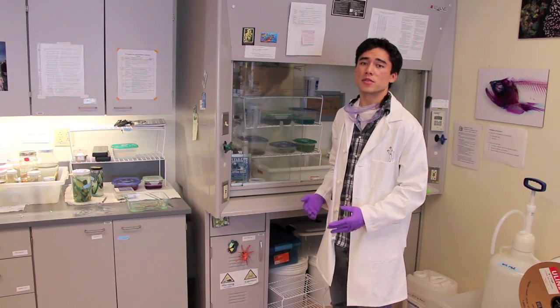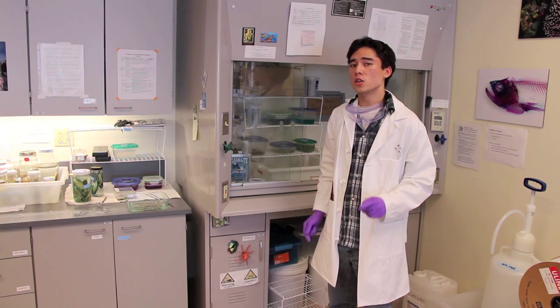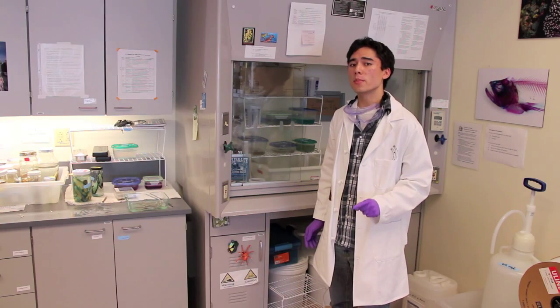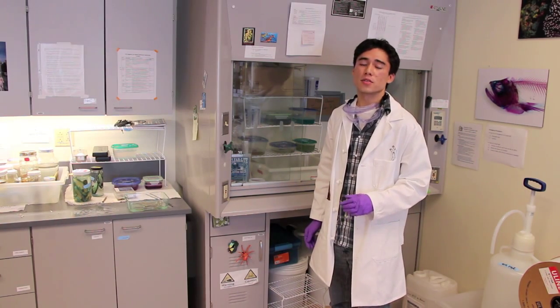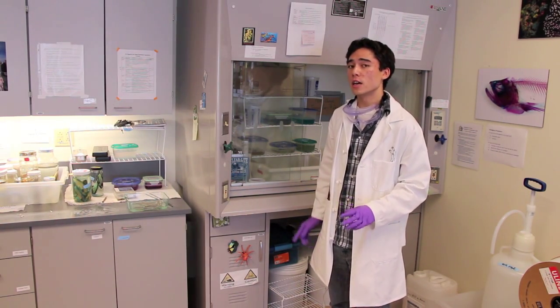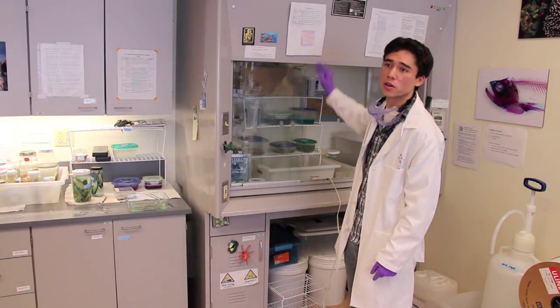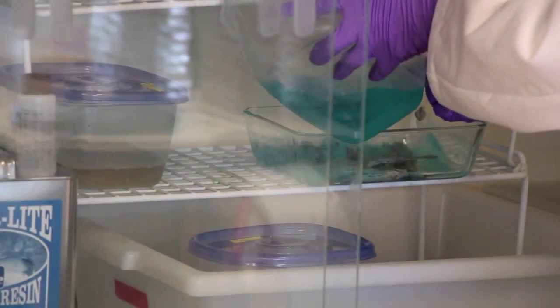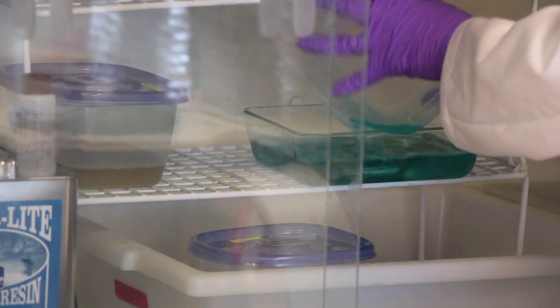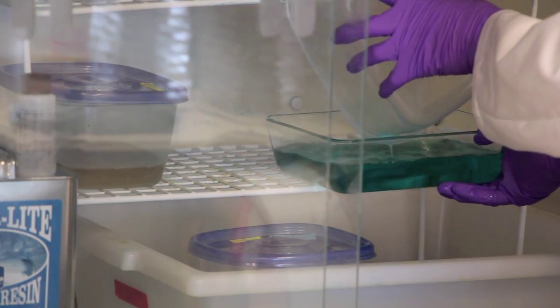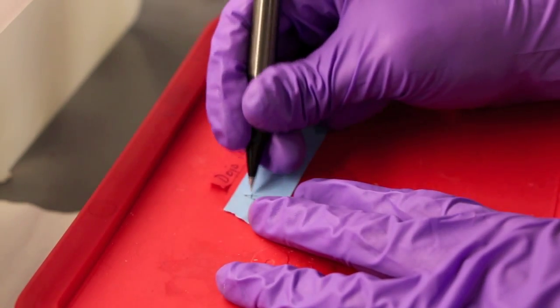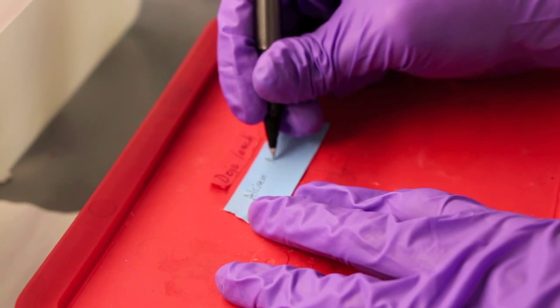Now that the specimens have been skinned, we're going to begin the process of staining the cartilage. To do this, the skin specimen will be placed inside a bath composed of four parts ETOH, one part glacial acetic acid, and a small amount of alcine blue dye. Now this stuff can smell pretty bad, so we're going to use this fume hood here to get rid of all that bad smell. And remember to label everything with the correct time and date that it was added to that chemical.